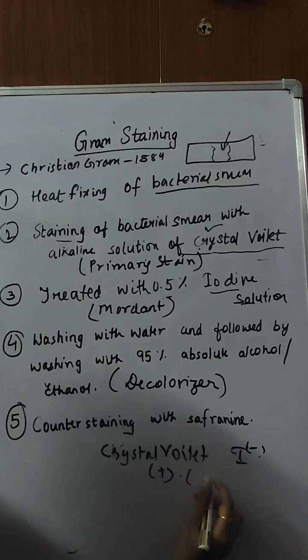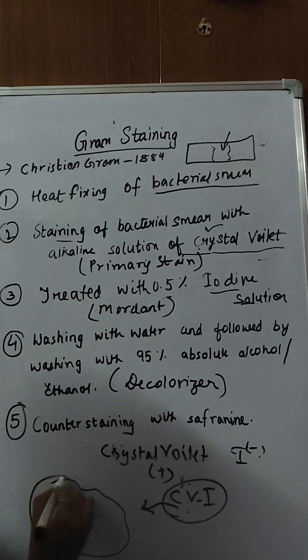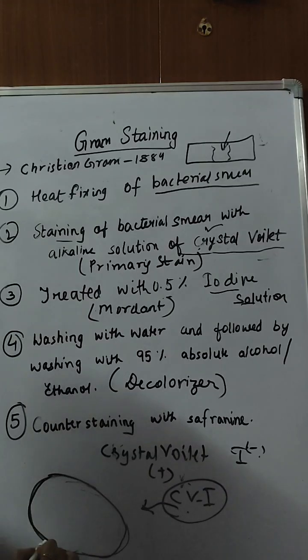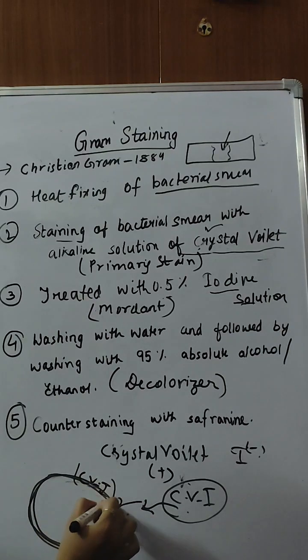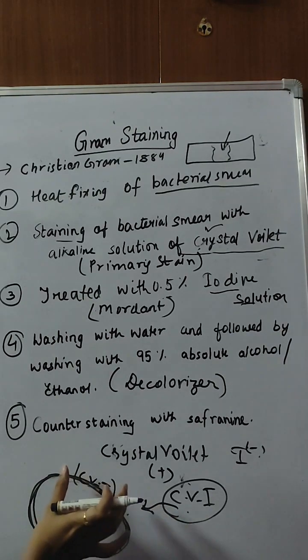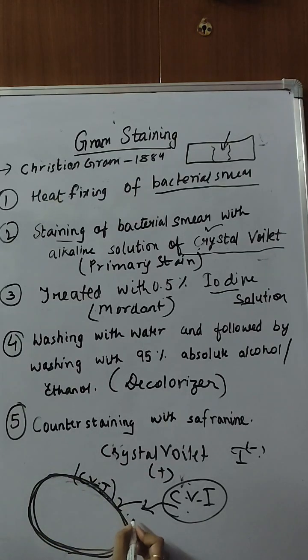Both will combine together and form the CVI complex, and this complex will get bound to the bacterial cell wall. It will make an insoluble form.